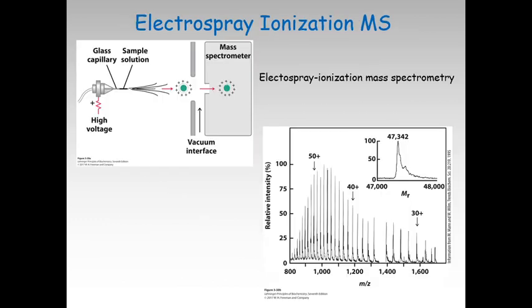And that will tell you what the original sequence of the protein is. This is a very brief explanation of what electrospray ionization mass spectrometry is. This is the basic setup. A protein solution, as you can see, is dispersed into highly charged droplets by passage through a needle under the influence of a high voltage electric field.